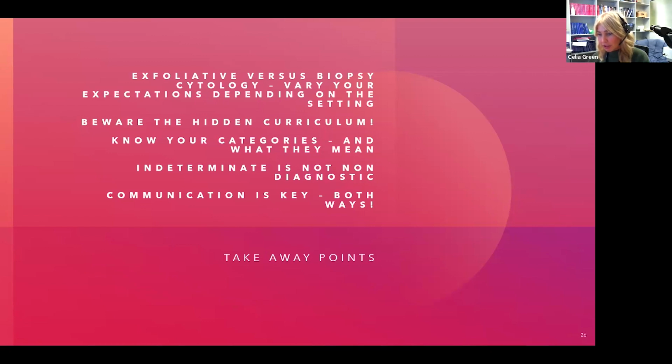some of the other studies tend to say that if you get 100 mils, that's basically the cutoff where things don't improve. So if you get 100 mils versus 300 mils, you're not necessarily going to get a change in your result. In this day and age, ancillary studies are king. We can do molecular studies on the cell block. So if you do send more, the only thing I will say is please don't send 2 to 3 mils if you've got more than that. It's very hard for us to get a good result.